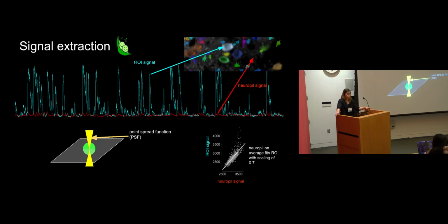So we basically just use a radius of a certain size around each cell, and I can't remember exactly if it's 150 or something like that. You can also set it in the algorithm to decide how big that radius should be. You don't want it to be too big, because the neuropil signal is somewhat local. So you don't want it to be the whole field of view, but you can watch the video and see how localized your neuropil looks and scale it based on that, because your zoom level might also be different from our recordings too. That's the way we do it in practice, because it's approximately true for the whole field of view, that you'll usually see that the spatial spread of the neuropil is fairly similar across the whole field of view.